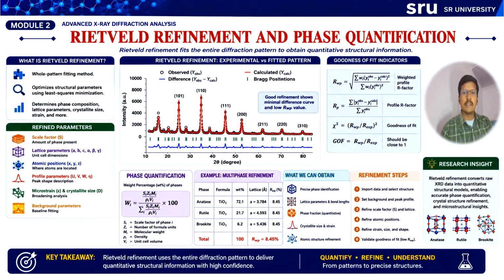For example, in multi-phase materials such as composites, catalysts or ceramic materials, several crystalline phases may coexist simultaneously, because people are doing binary and ternary nanocomposites, where two, three or more phases will be involved in the crystal structure.